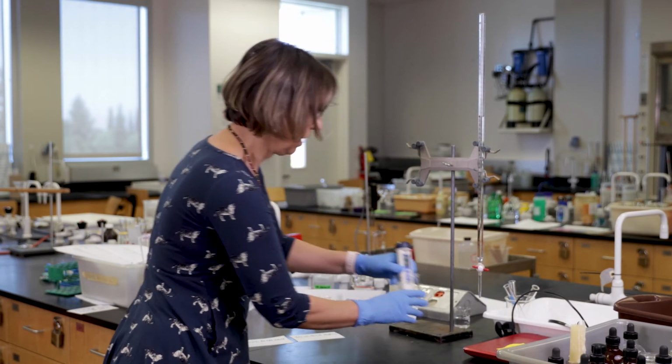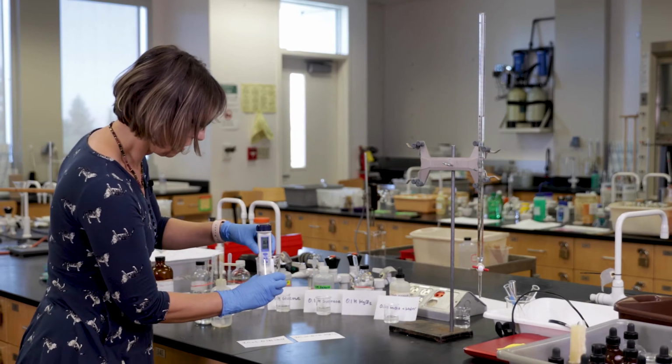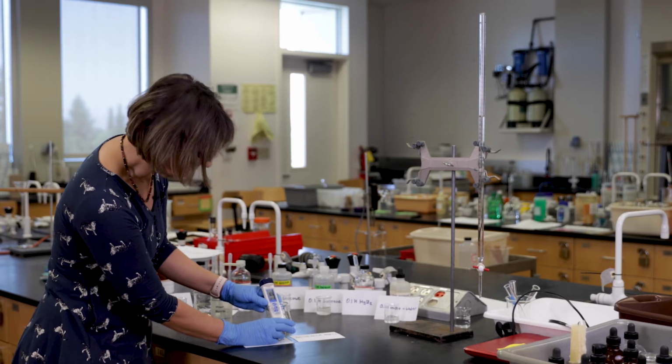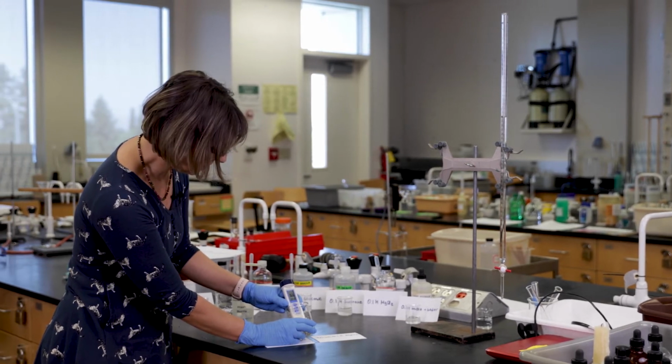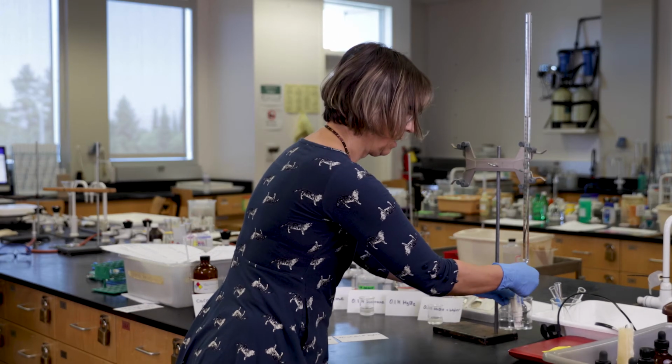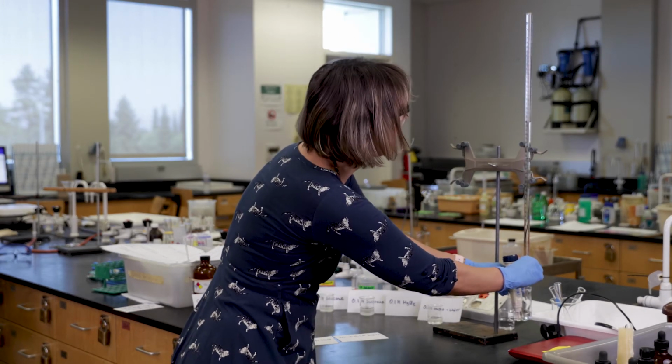Just going to continue adding 10 milliliters of water. Now I added another 10 milliliters. Just stir it a little bit. And the measurement now is 3.66 millisiemens. Another 10 milliliters added.